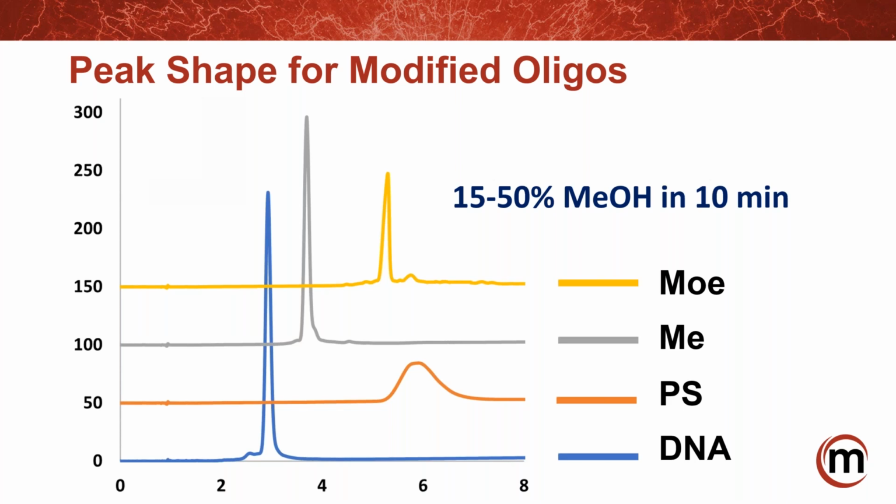And so even though these aren't needle thin for the phosphorothioated modification, which is one that they want to look at a lot and does give very tight peaks for the ion pair, you can adjust this. I could compress the gradient there to focus on that if I were all phosphorothioated. We're working to move that forward to improve the phosphorothioated, and we've had some feedback saying, hey, all our oligos are phosphorothioated. And it's like, okay, well, maybe we can look at adjusting it so that we can get better, sharper peaks for that. But I don't see that as a real problem. I think that's just some more method development that we can do.